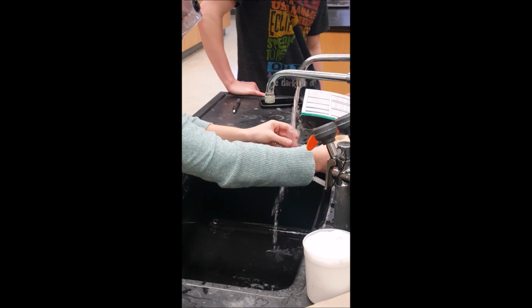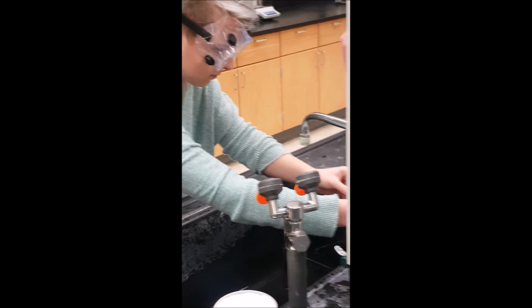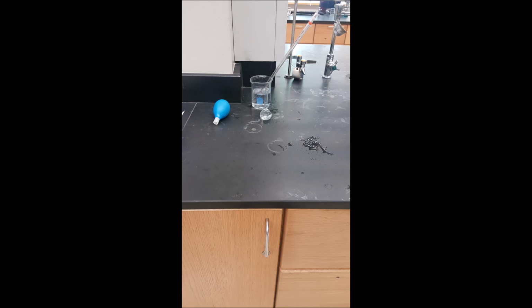Make sure that after you clean your glassware and you dry it thoroughly, check for any cracks and go and clean up your area. After you've cleaned up your area, leaving no solution left out or any solution on the table, you're ready to end lab.